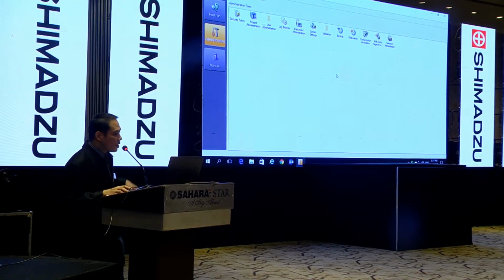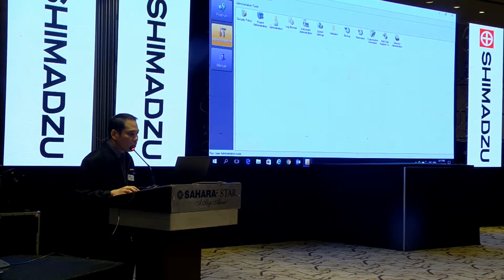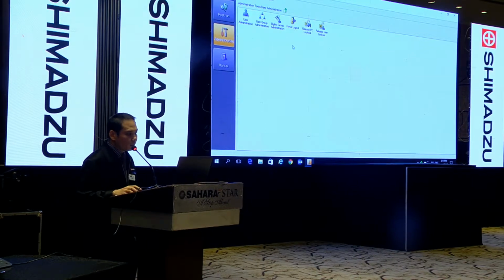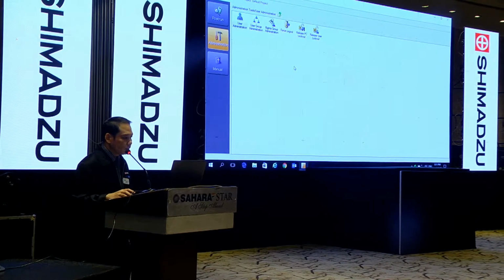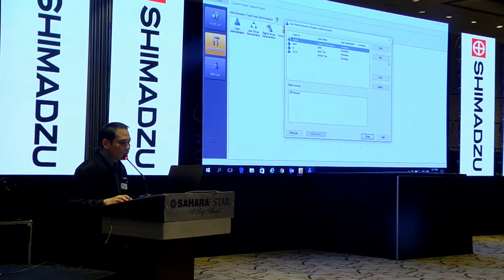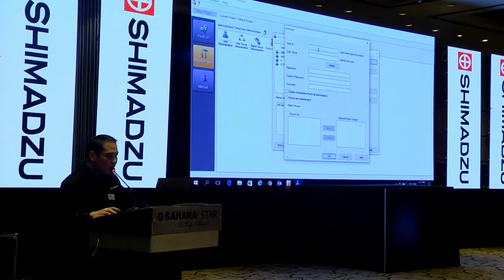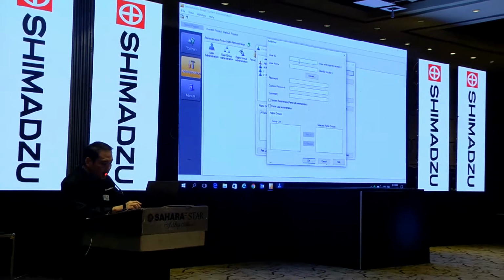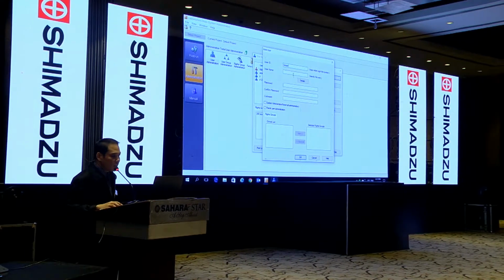Once you are logged into Lab Solution Data Manager, you can create users. So for example, I add another user, give the user ID Sanjay.